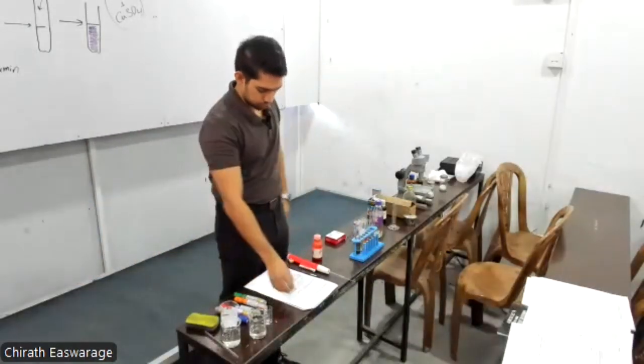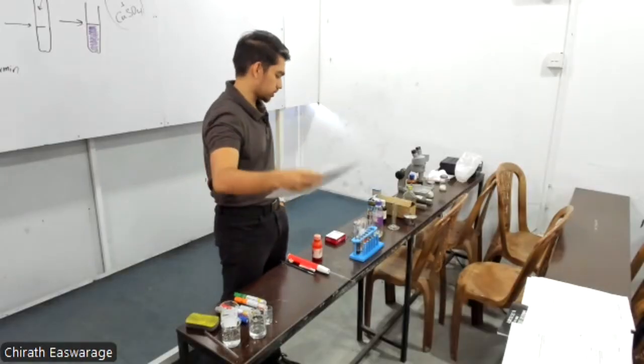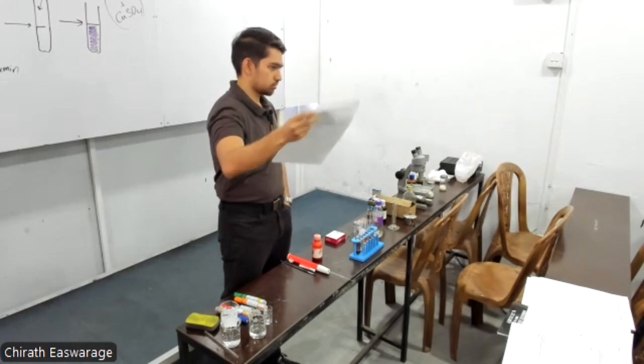So highlight red stained oil layer separates the surface of the water. Color of the water remains unchanged. Right? Highlight, that is the observation. Right? Observation.